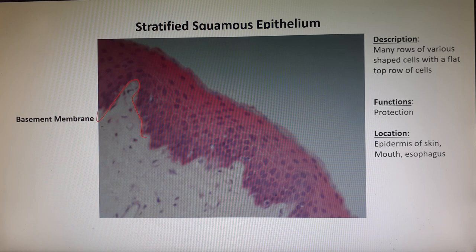Those are the epithelial tissues you have to know for the lab exam. Happy studying.